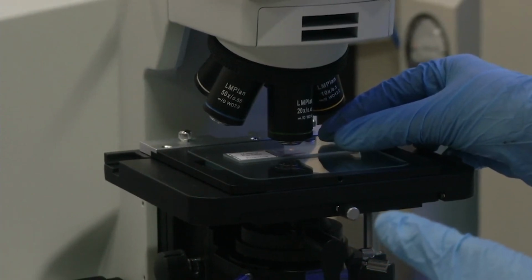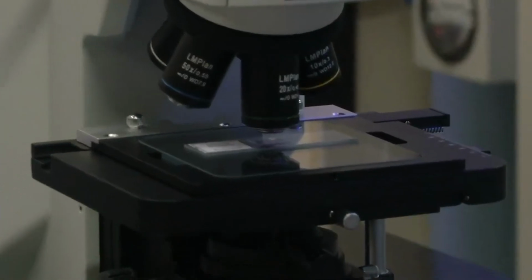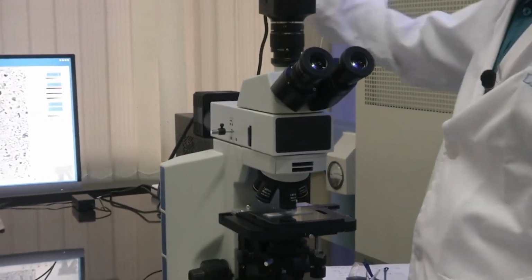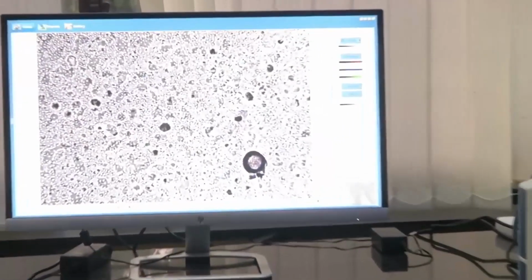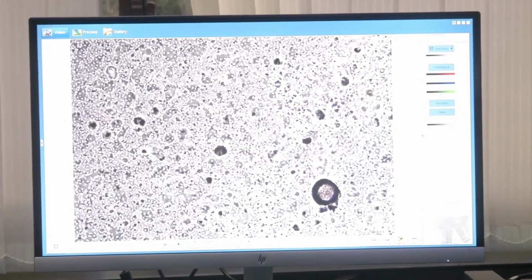Okay. So, now once we put the sample, we have to first see it through the eyepiece. Because we have a camera connected, you can actually see what we are seeing on the slide on the screen. Now, you can look at only the screen as I change the different knobs. Let us say now you can see, right, there are a lot of dots and other bigger pieces. This is the malarial parasite slide which we are seeing.